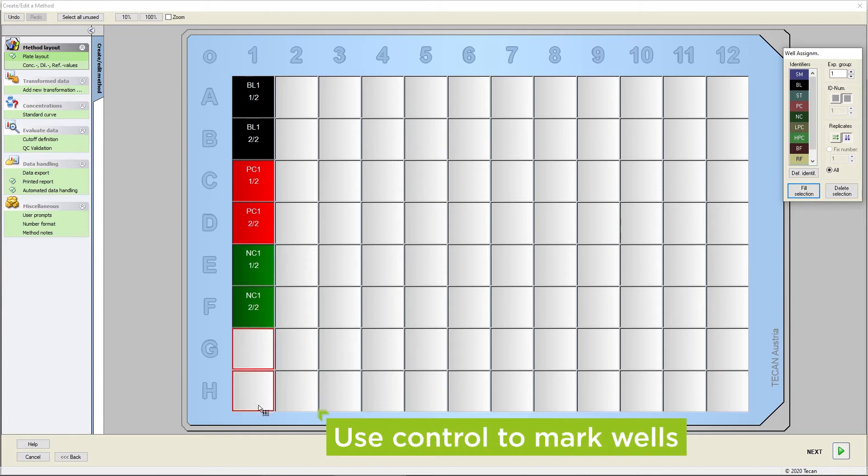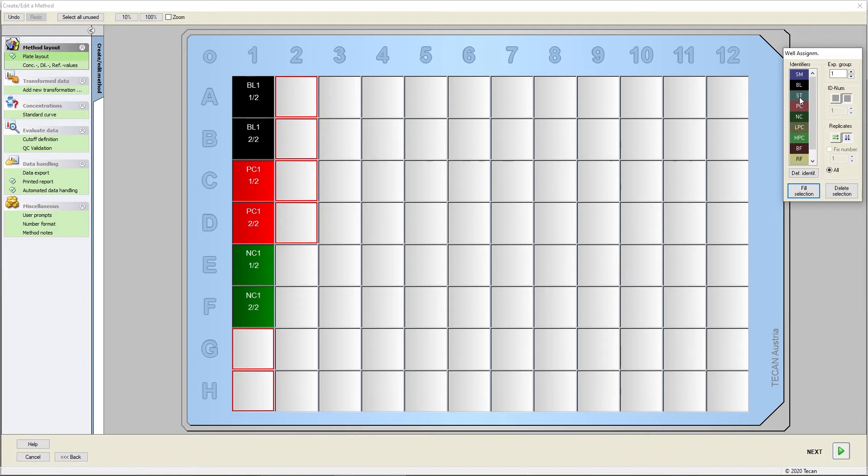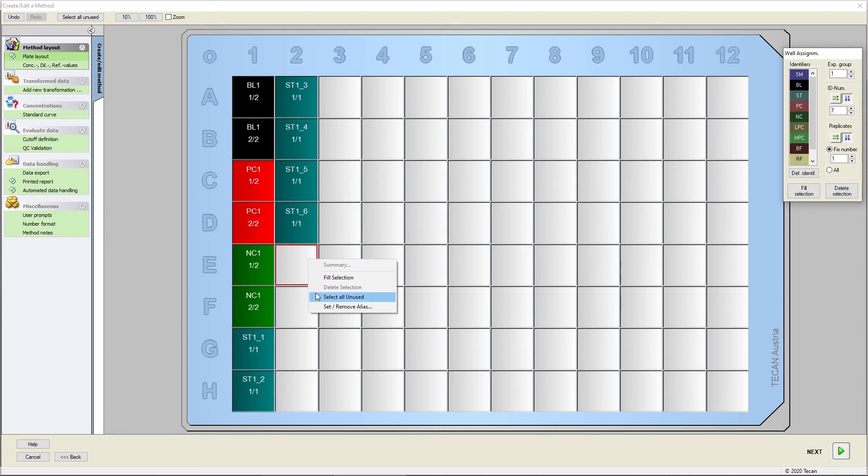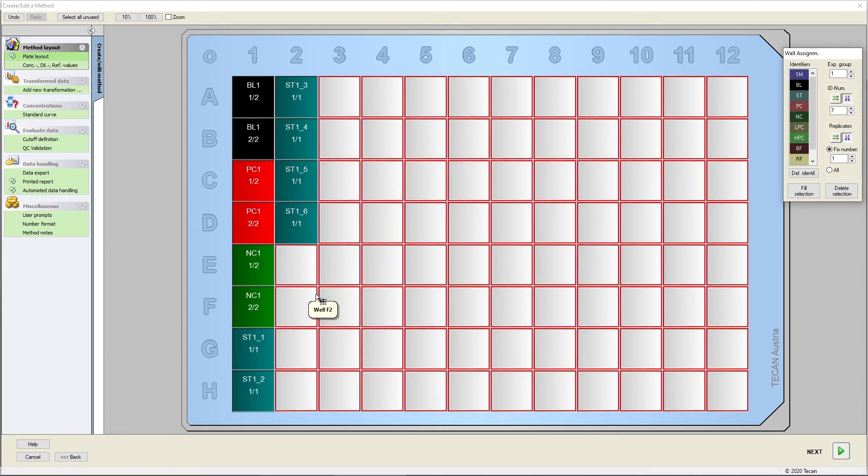Define the standards to enable the calculation of concentration based on a standard curve. Finally, define your samples by selecting all unused cells.